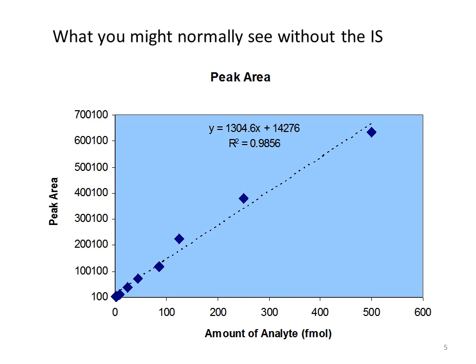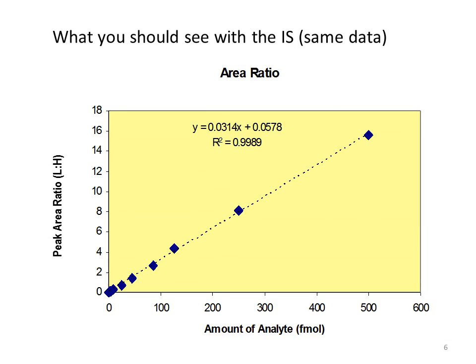And so that variability from, sorry about that animation, that was weird. The variability that you see, or the distance away from that linear regression, is due to any kind of issues that are going on with my sample preparation, delivery to the instrument, detection at the instrument, but it's also happening to my internal standard, and so it's drawing it back to create this more linear response.